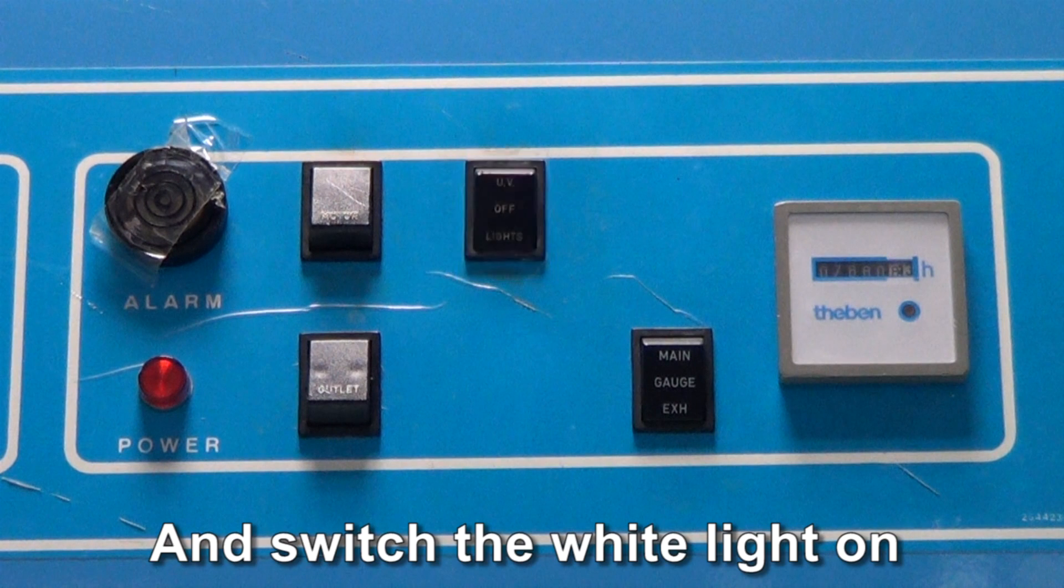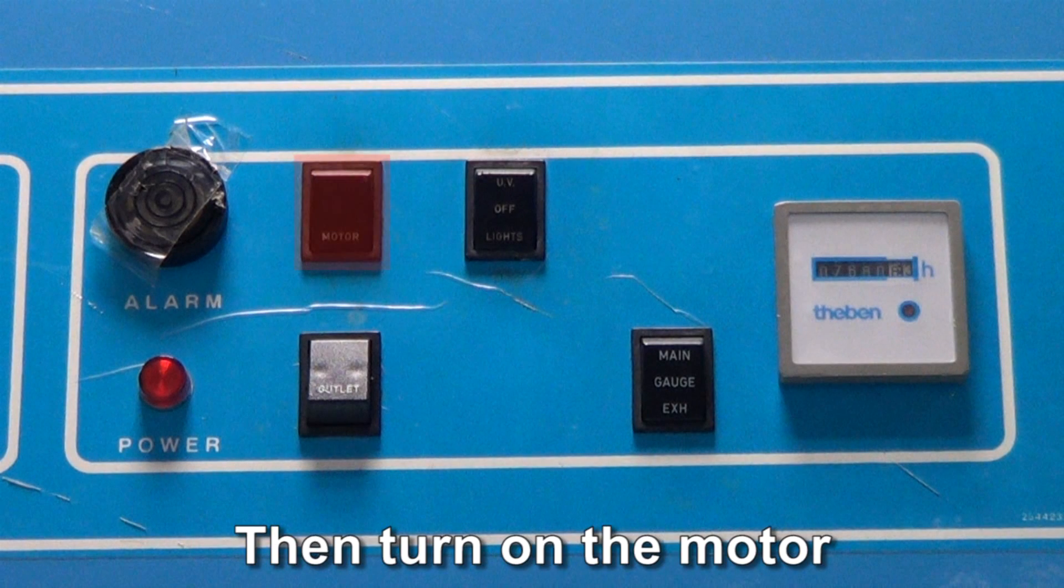Setting up a class 2 biosafety cabinet. Start by switching on the cabinet. Switch off the UV light, then turn the white light on and turn the motor on.